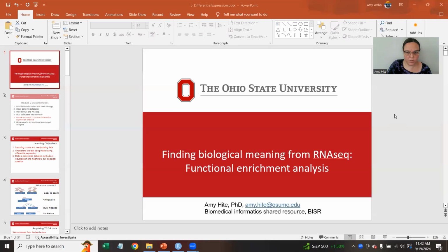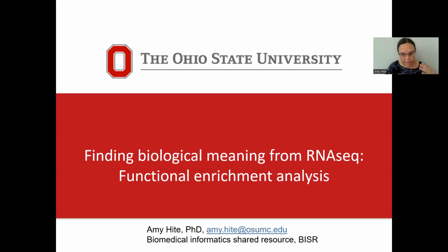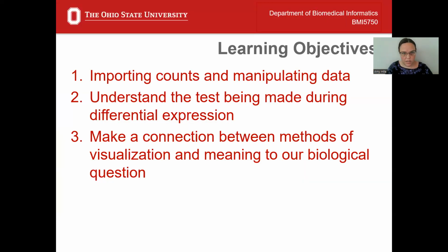Okay, we're recording. So we are continuing our survey into NGS data. And today we're going to talk about finding biological meaning from RNA-seq. And so we're going to do some differential expression analysis.